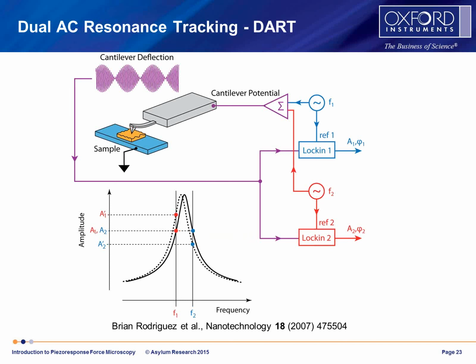And this kind of behavior is what we use in the feedback loop. Now instead of phase or amplitude alone, if we look at the difference between A1 and A2, and we use that in our feedback loop to track the resonant frequency, we can get a measurement that is independent of the drive phase.